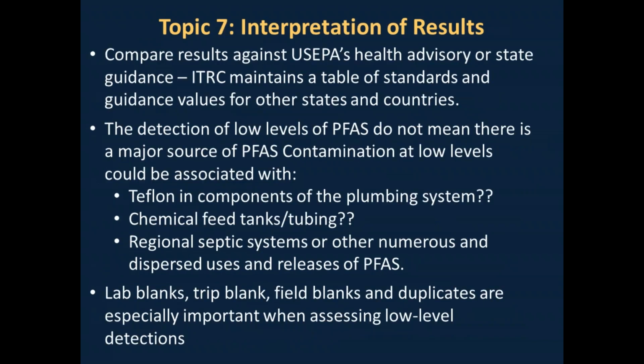And lastly, the primer deals with how to interpret results. We provide references to EPA's health advisory, as well as the Interstate Technology and Regulatory Council's table of state standards, guidance, and advisory levels. And actually, that table has values for other countries as well.